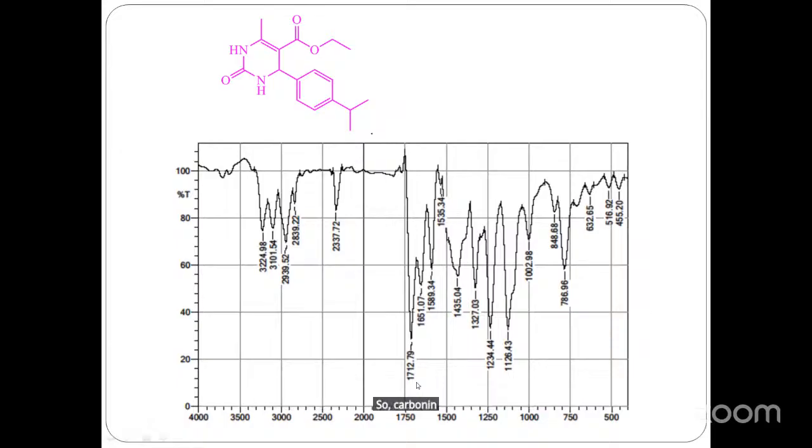So you must explain the IR spectrum to your research guide, or whenever you are explaining your research to the audience in conferences and in your presentations. Here the frequency is at a lower value. You must find out the reasons for the frequency change. Always remember.